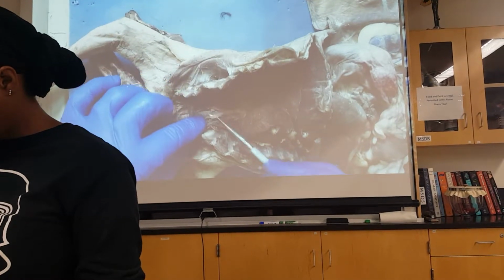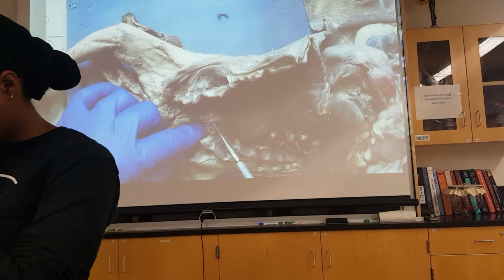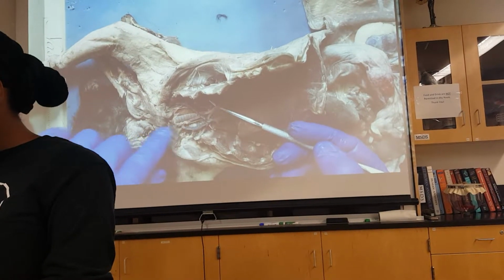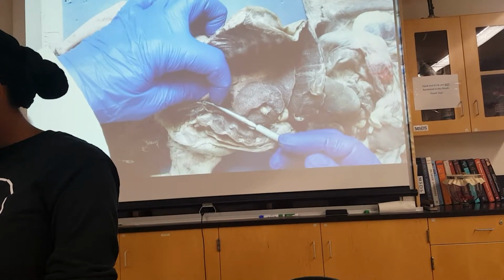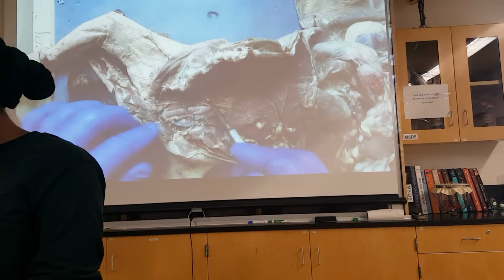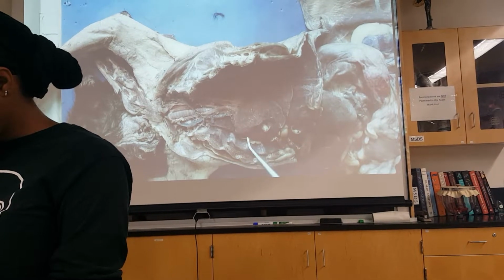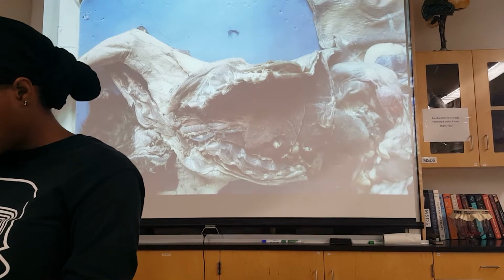If I pull this over, there's the rest of the brachiocephalic, and it doesn't quit until it finally divides into 2. And you can see that here. And right common carotid, which you can see running up next to the trachea here and up into the head. And then the right subclavian here, which is running off into the shoulder and the right arm. So we wind up with 4 branches, one for each arm and one for the head. It's just that 3 branch off of here and 1 branches here. So those are the major arteries of the thoracic cavity.